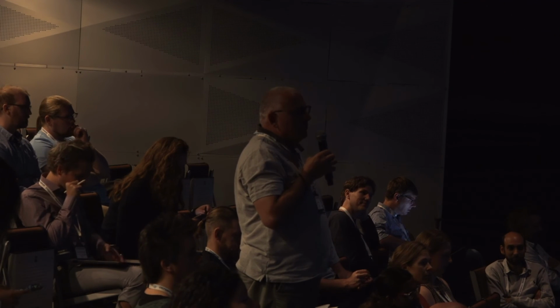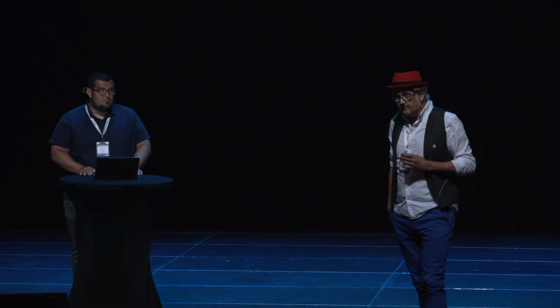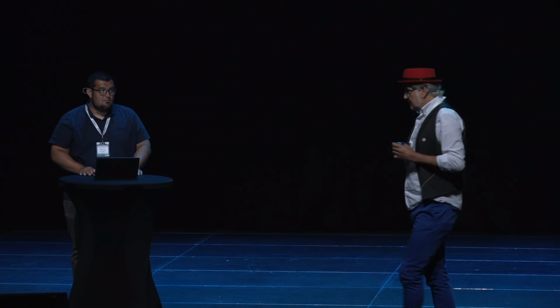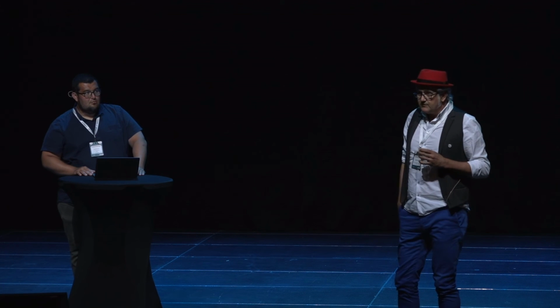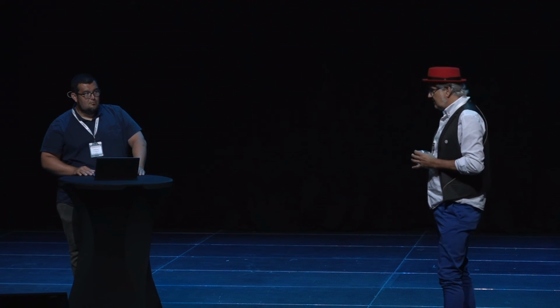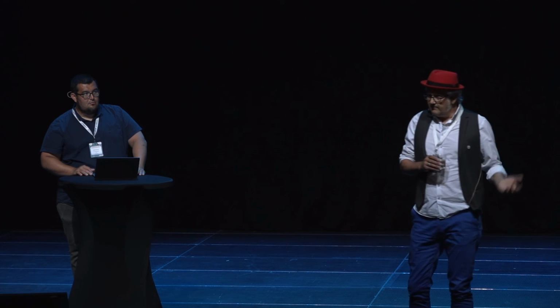Thank you for that. That's a very good question. The reason for it, first of all, I know you could do post-image processing, doing SRRF in Fiji, ImageJ, whatsoever. And that is applied by groups who run their own instruments. That is not really feasible if you have a central institute running with dozens of users, where the PIs just say, why is he spending 2 hours on a computer in your institute? What's he doing there, right?